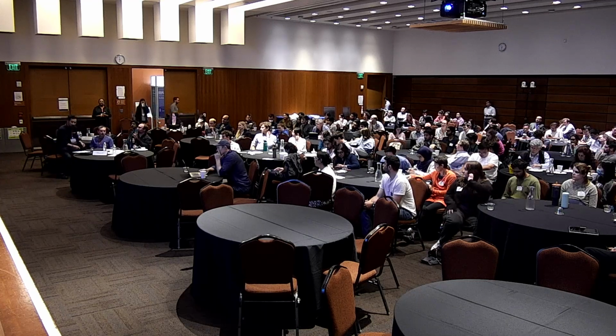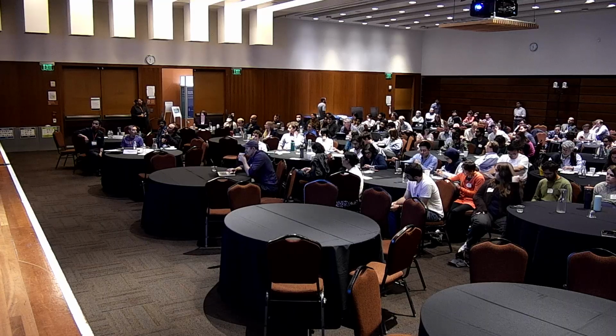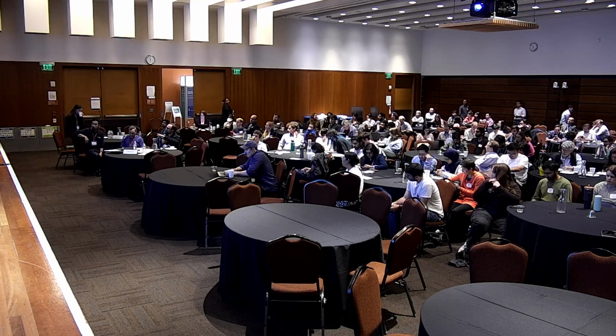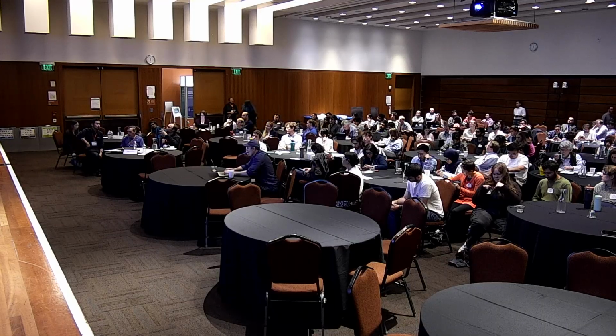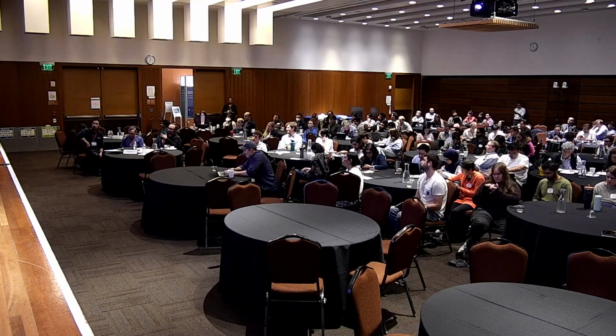One of the issues that we face when playing with some of these things is you change a little bit of imaging conditions and it's like a whole new training process for the segmentation, for the tracking. I don't know how this algorithm does in terms of that. Can we get to the point where you just give it something and it tracks it without having to go through 3 months of optimization?